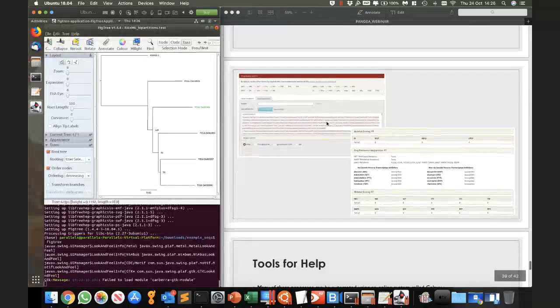So it looks like this. When you go to the website, it looks like this. You put in your sequences here, you press OK or something, and then it will give you this nice little report. It tells you the different resistant mutations, and then a list of drugs, what could be resistant, what might be susceptible, or whatever.